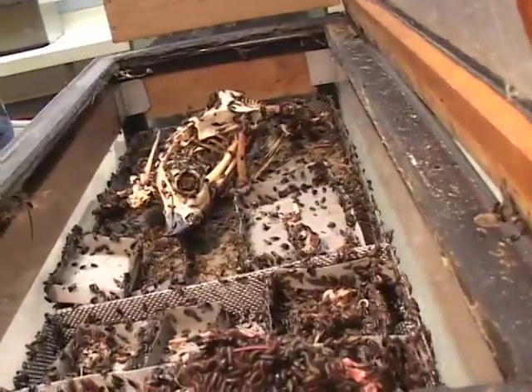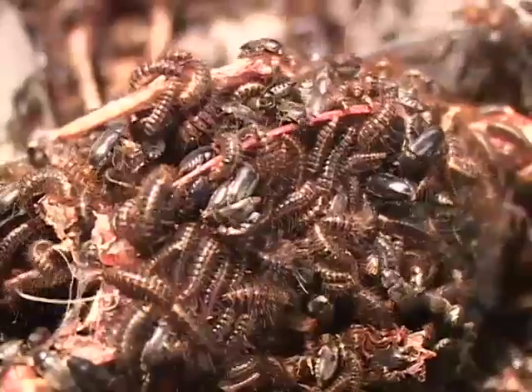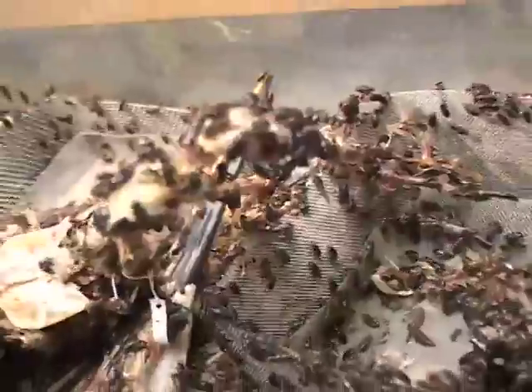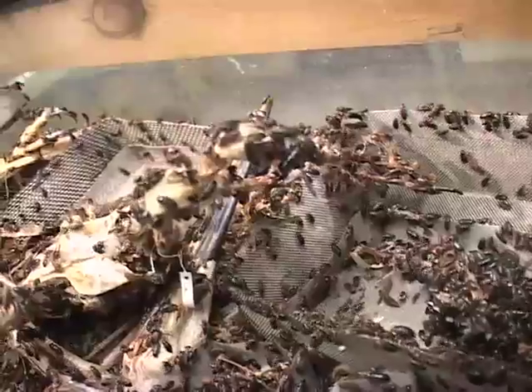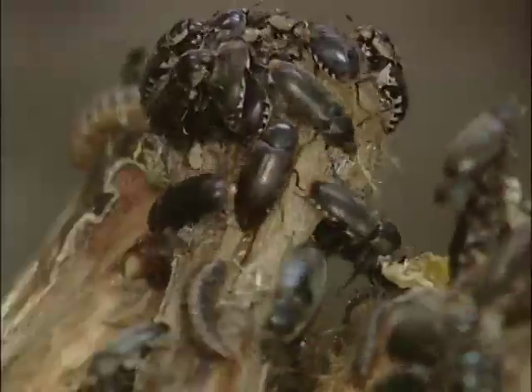They're on a permanent lunch break in there, but it certainly is great to have this technique. I mean, it still requires a lot of work, so it's not like they serve you up the skeleton with no effort on our part, but to go through the numbers that we go through, which is a few thousand a year of individual birds, it would be almost impossible without this.